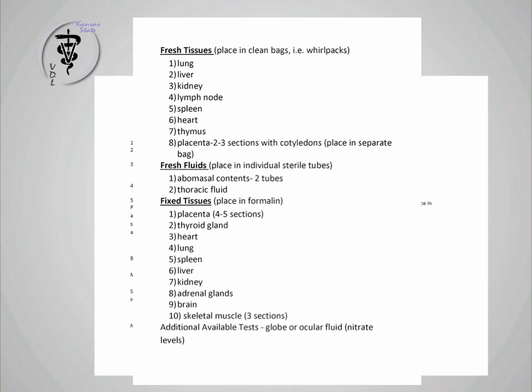Oh, thank you, Dr. Lubers. So Dr. Lubers asked if any kind of tubes were appropriate to put that in. So you want to put it in a non-additive tube. So don't put it in a purple top. Put it in a red top or put it in a sterile tube with no additive. If you want to leave it in the syringe, you can even do that, but please remove the needle. I would really appreciate that. That doesn't always happen, but if you can remove the needle before you ship it, that's great. You have little stoppers or just the cap without the needle on the end.